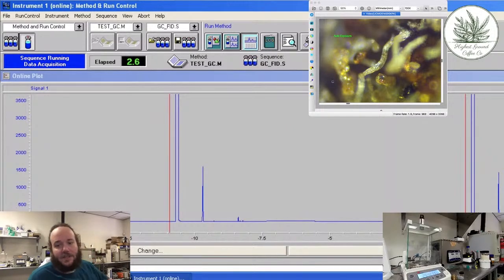Well, the first thing to do is go through and make sure all the runs were essentially valid. And of particular importance will be making sure that the calibrations ran correctly. So what we'll be looking for there is, we did a 3-point dilution. Now I do have my suspicions. It is your flower under the microscope, Phil.